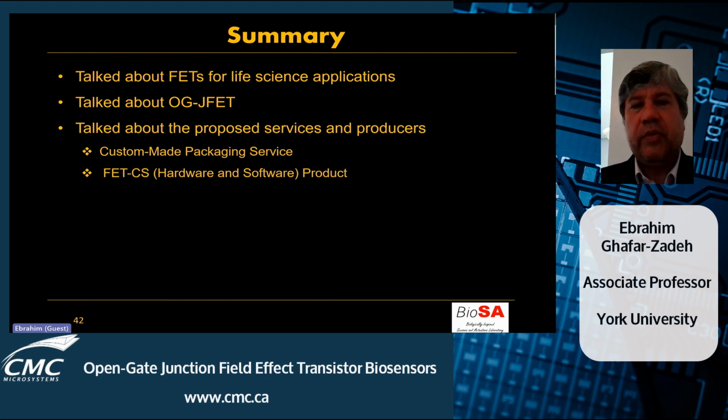Okay, so let me summarize my talk today. Today I talked about different applications of FETs for life science, and specifically I moved into the detail of the Open-JFET device, one of our devices that we have developed recently, and I showed you different applications of that. In addition, I showed you two of the products that we develop beside our research that can be used by our networks: the hardware system, the characterization system that includes hardware and software, and also the packaging method.